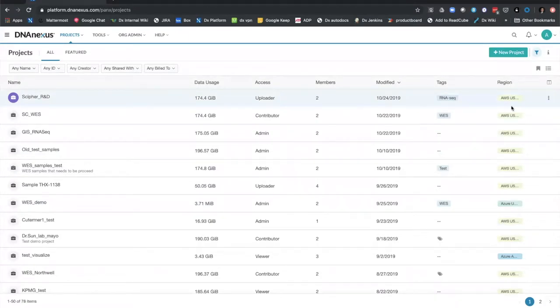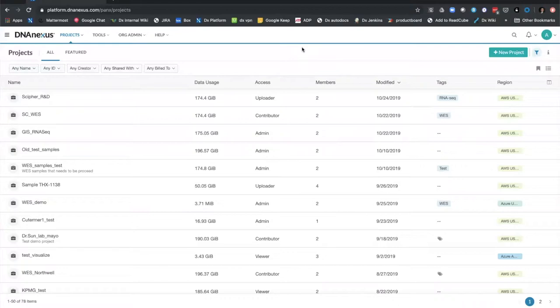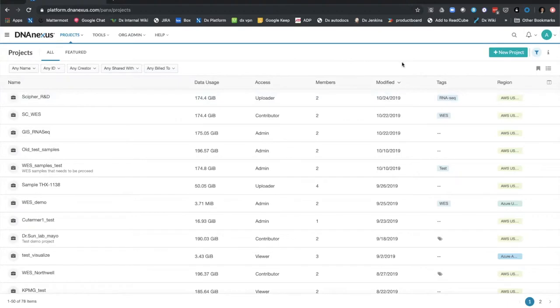It's the single pane of glass experience for running the same workflows and apps across different regions, giving you the flexibility to run genomics analysis without having to be too concerned about what's happening in the back end. As my next step, since we've gone over the metadata associated with projects, I'm going to create a new project. Say I have some data coming from the lab and I need to get that processed through the DNA Nexus platform.